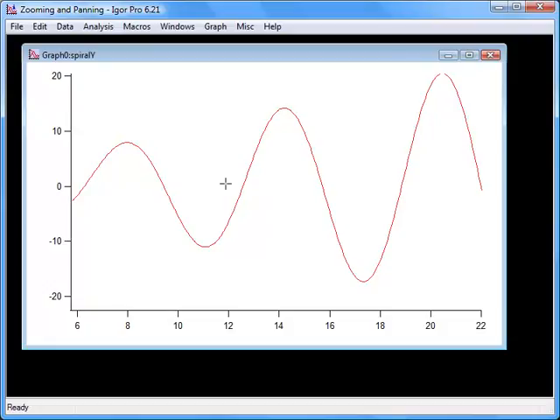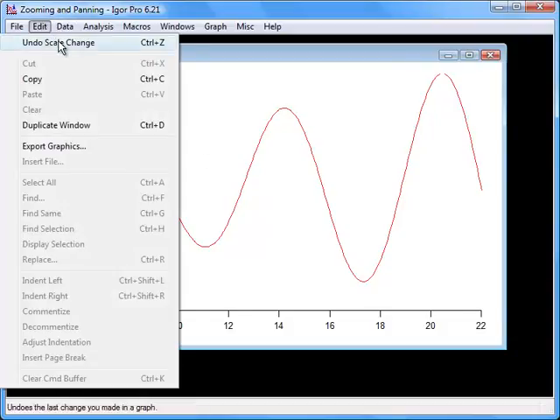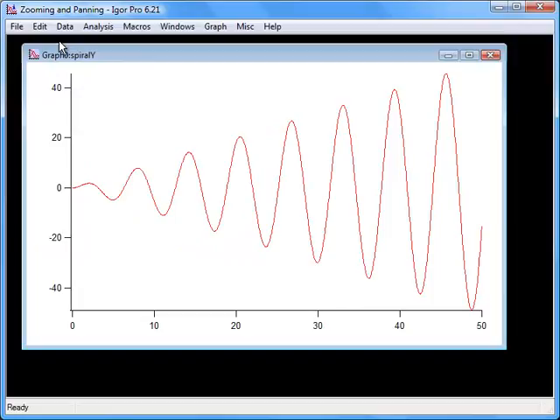To undo the scale change, choose Edit Undo Scale Change. To redo the scale change, choose Edit Redo Scale Change.